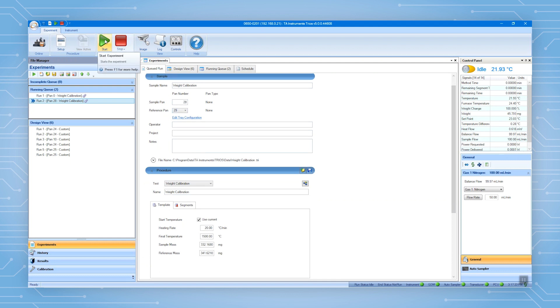For units with an auto-sampler, the two runs are automatically executed.